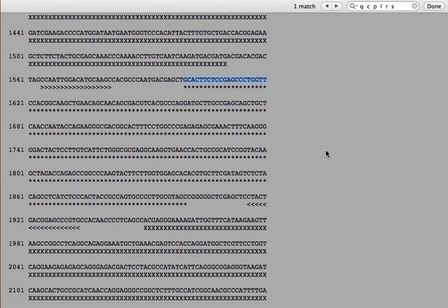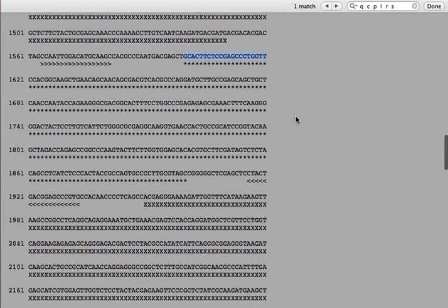if you for sure want to have a specific site amplified. The problem there is that it sometimes makes the primer less desirable, meaning that it'll bind to itself or it'll bind to other primers. It won't bind very well to your DNA. A variety of things. Its melting temperature might be too low or too high, so it's not useful in the PCR reaction. And so that's why we use the software.